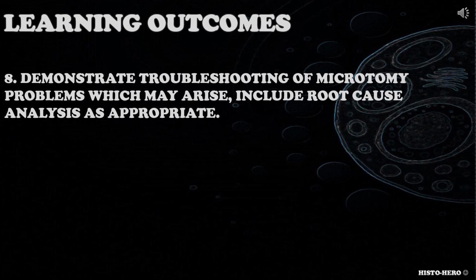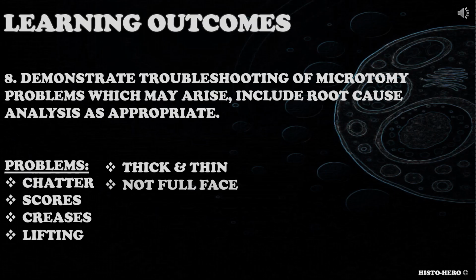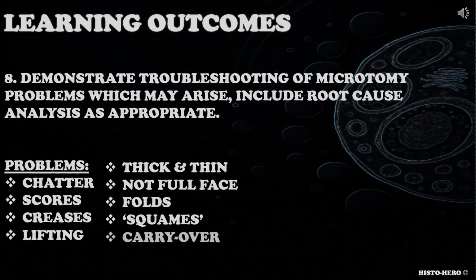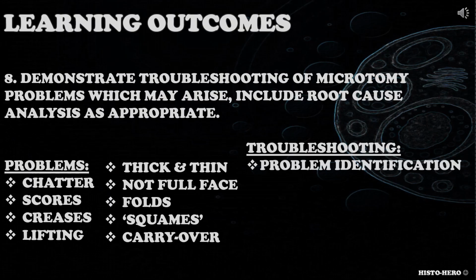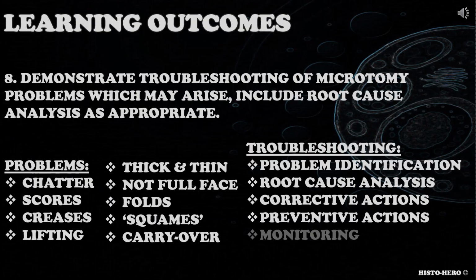Candidate could consider various problems like chatter, scores, creases, tissue lifting, thick-thin cutting, not full face, folds, squams, carryover. Troubleshooting steps they would take to resolve the issues like problem identification, root cause analysis, corrective and preventive actions, monitoring, documentation, and so on.